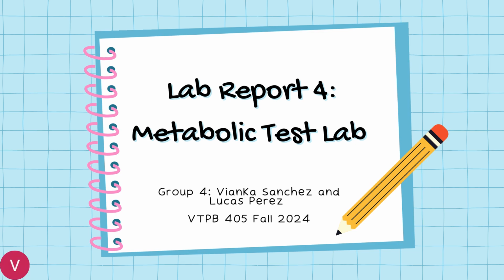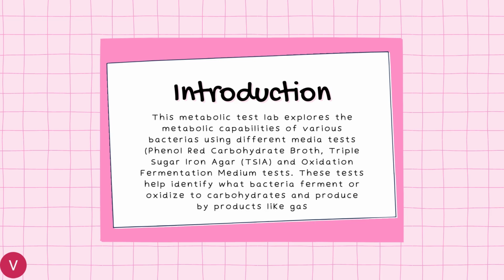This is Group 4's Lab Report 4 on Metabolic Test Lab by Vianka Sanchez and Lucas Perez. This metabolic test lab explores the metabolic capabilities of various bacteria using different media tests, such as phenol red carbohydrate broth, triple sugar iron agar or TSIA, and oxidation fermentation medium tests. These tests help us identify what bacteria are able to ferment or oxidize and produce products like gas.